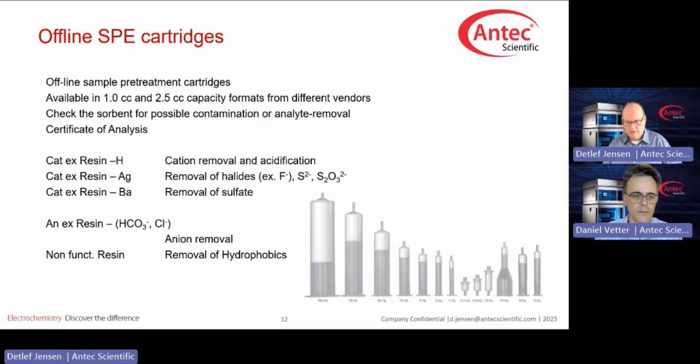Number two, a little piece of practical advice. When do I use these offline cartridges? Well, honestly speaking, only when I have to, because each of the cartridges does cost money, and you have to buy them for that purpose. You have to keep a stock of them if you are using them. So only when needed.